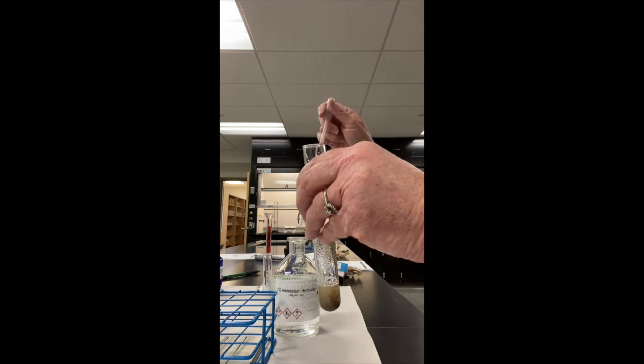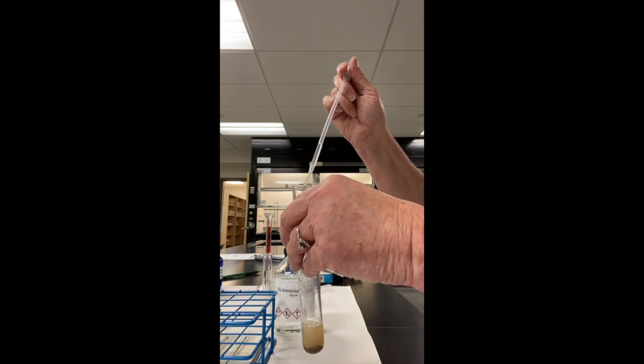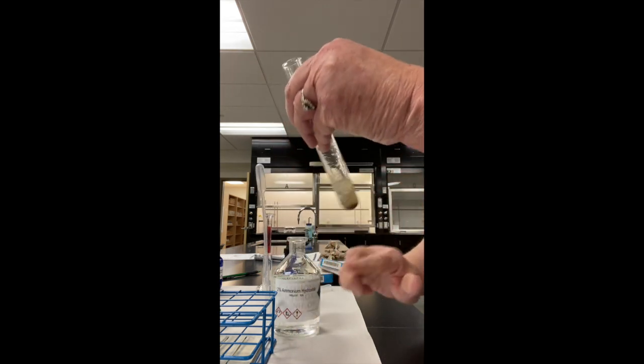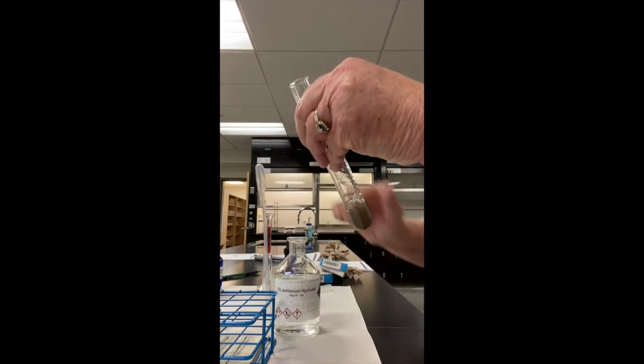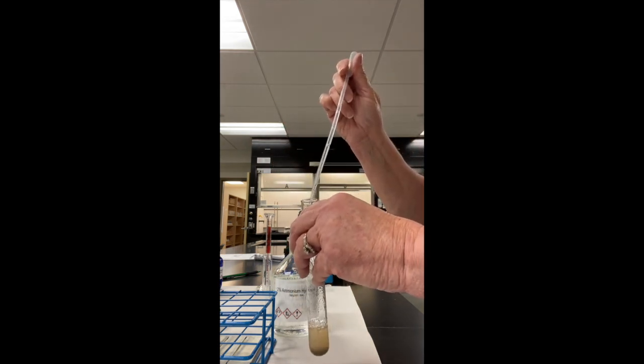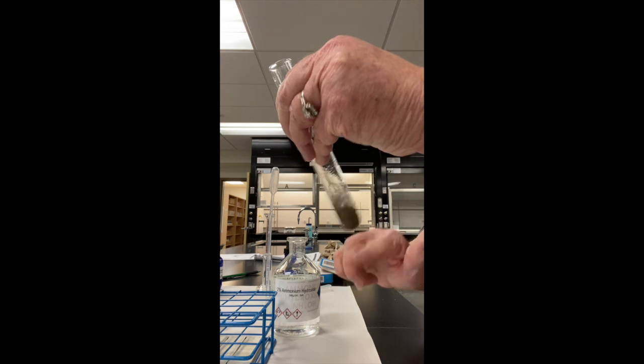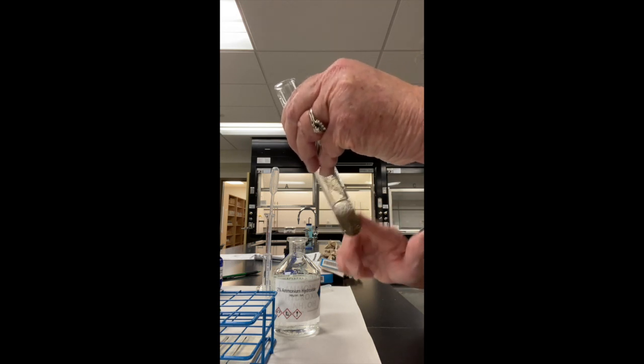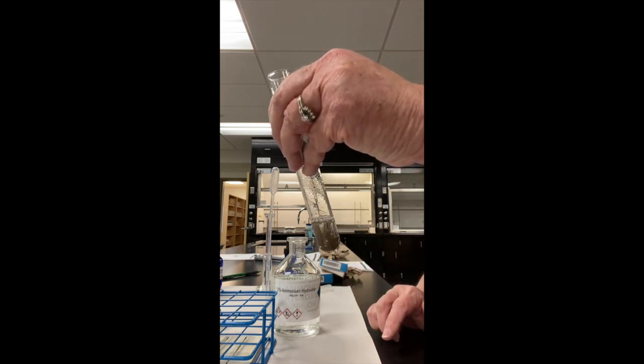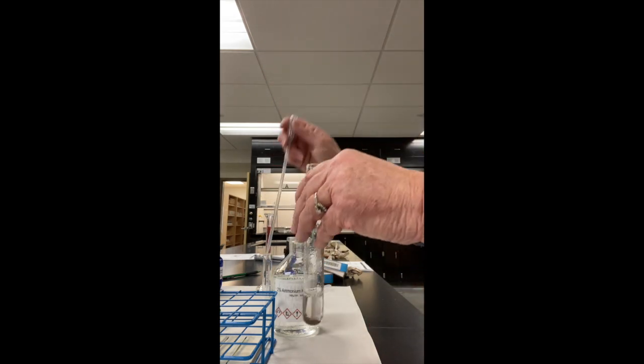The directions say add just enough ammonium hydroxide till the precipitate goes away. So I'm going to add a couple of drops. Let's mix that, see if it goes away. Not yet. I'm going to add a couple more drops. About five drops there I'd say. We've got a lot of the precipitate. Notice how it's going to the bottom, and then it's much more clear at the top. I'm going to go ahead and add about five more drops because I don't want to put too much in there.